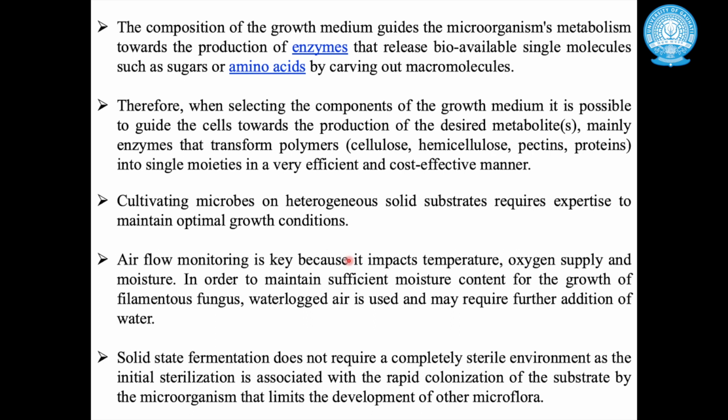Solid state fermentation does not require a completely sterile environment, as initial sterilization is associated with the rapid colonization of the substrate by the microorganism. This is also an important factor because fungi grow very fast. Their doubling time is quite fast. They can overcome the growth of other microorganisms, so you need not go for too much sterilization, which is not true in the case of many other microorganisms that also support the growth of important metabolites.